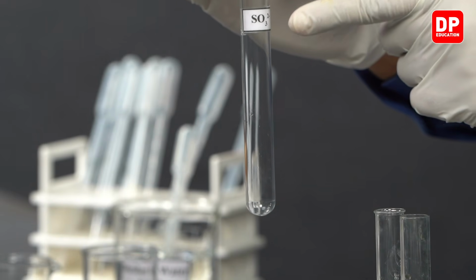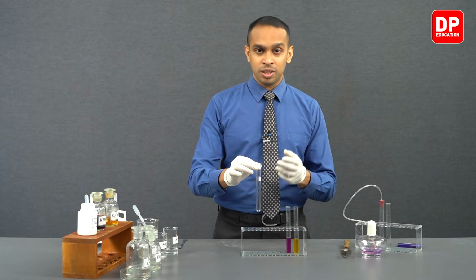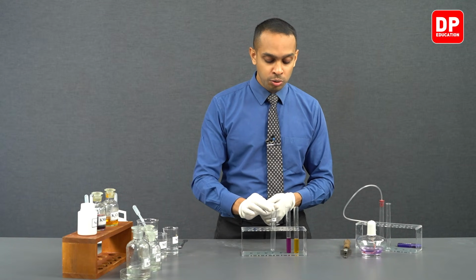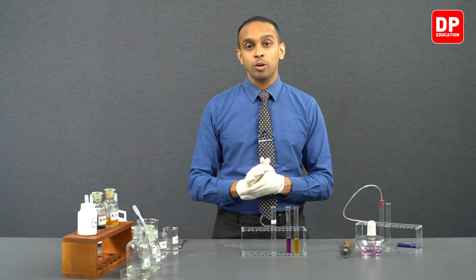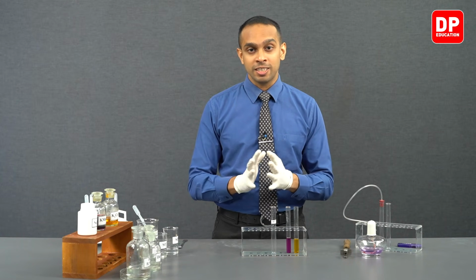That is because we'll be taking solid sodium sulfite which contains sulfite ions. And we are going to add hydrochloric acid to this sodium sulfite solid. This is going to release sulfur dioxide gas, which is a pungent gas.